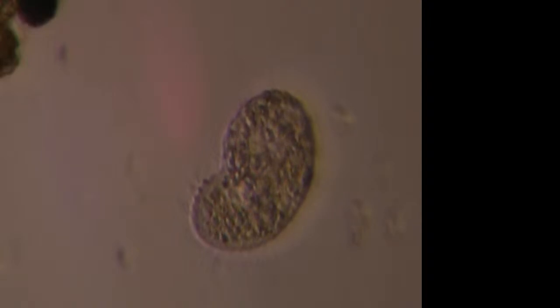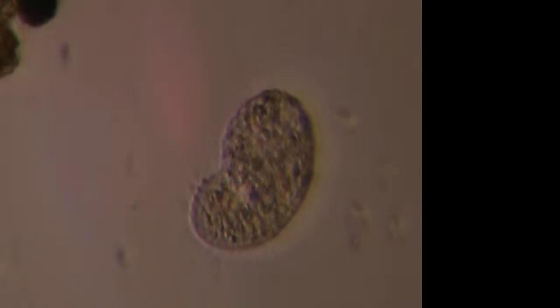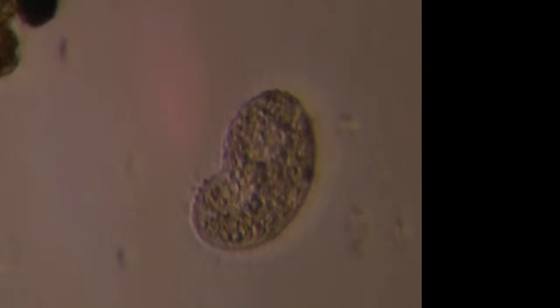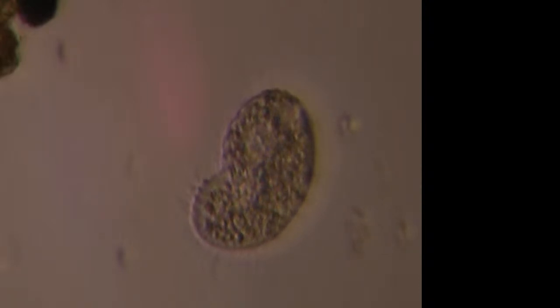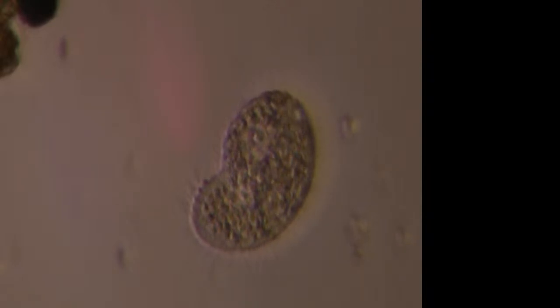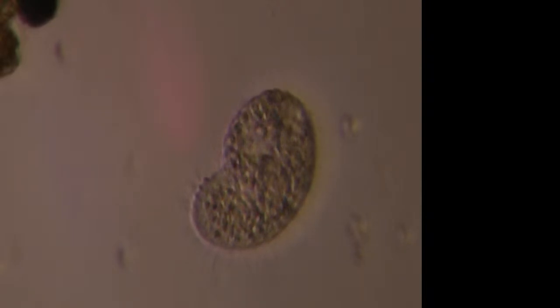This one's actually lasting much longer. I think the cell is trying to heal itself, but it's maybe on a collision course with death, because usually when they stop moving and they just start rupturing, it's usually a one-way ticket.